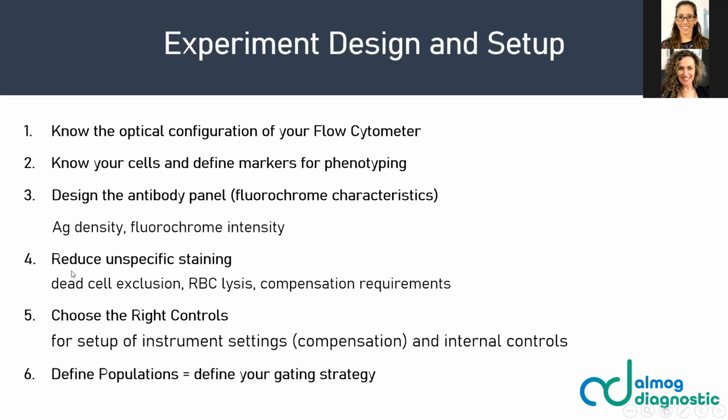Another thing that you always need to think about is the unspecific staining, because in all biological experiments and biological systems, unspecific staining can occur. And we have to address it and do everything we can in order to minimize it.